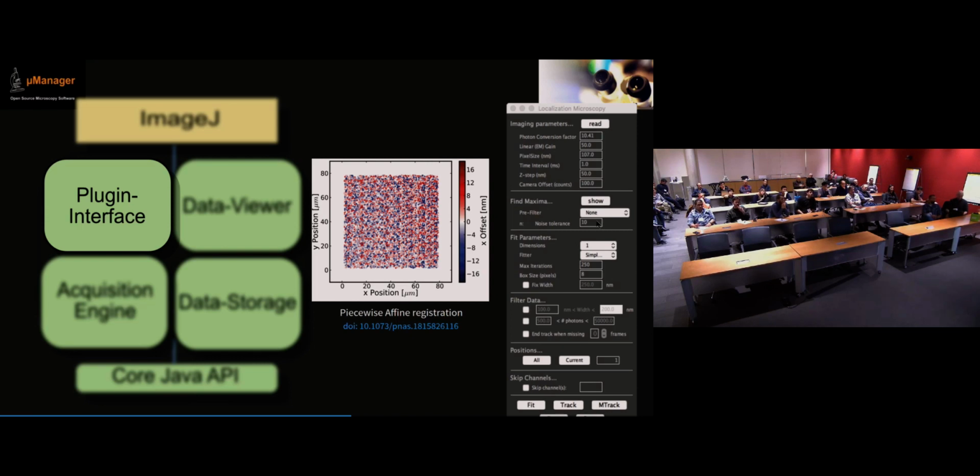And that's all pushed in here, where, retroactively, I don't know if this was the wisest decision. For me, it's just very easy because I put it into the Micro-Manager source code and it gets built and people can use it immediately. But this was kind of a pain to maintain for myself.